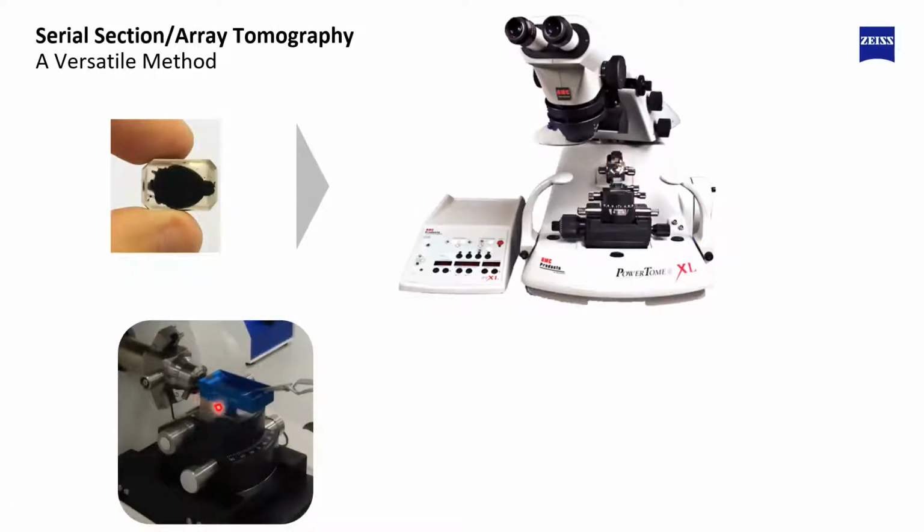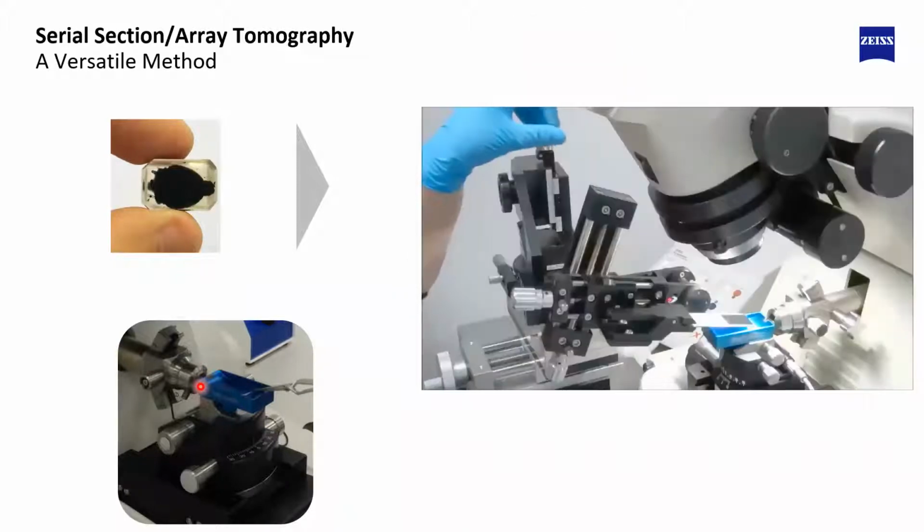What we can see here on top of that is a diamond knife with an attached boat, like a small water cup attached to it. And the sample would be sitting at that long lever here. Eventually it's hidden here, but I have a video in a second that really allows you to appreciate how that actually comes about. So here, this is actually a similar tool.